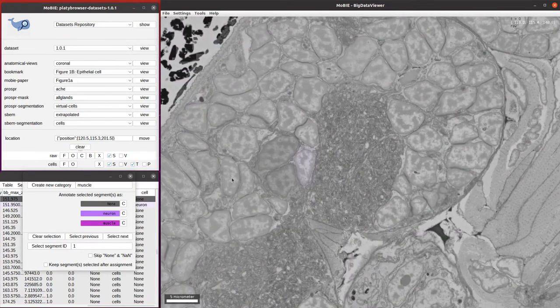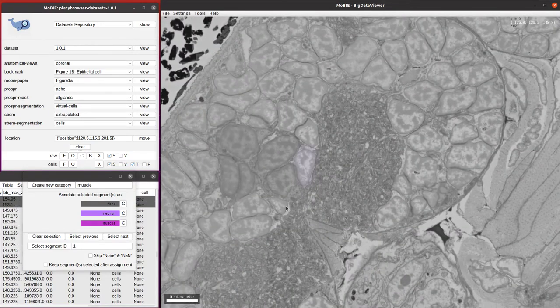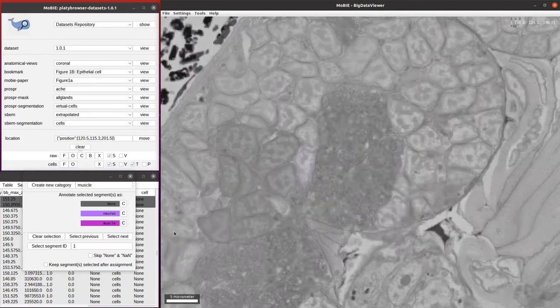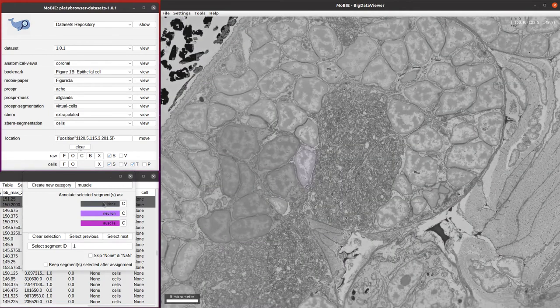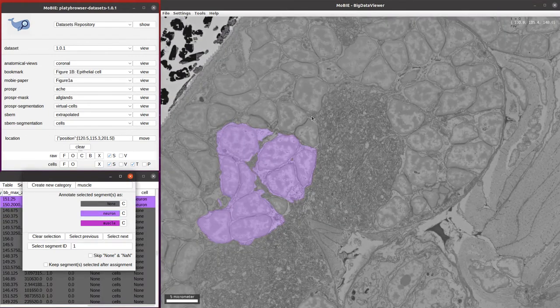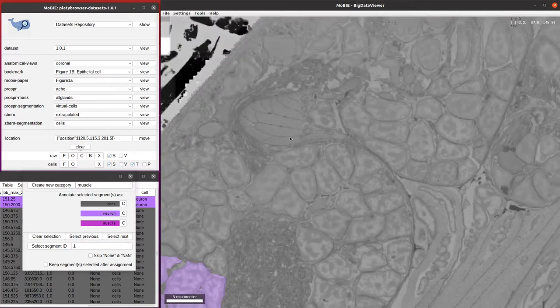Now, if we want to assign lots of neurons in one go, we can click on multiple different neurons and then click the neuron button and everything gets assigned in one go. That's a quick way to do more.